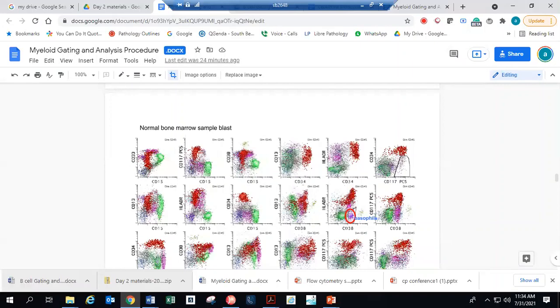Okay. And those populations can actually be gated there, and they use the markers just to clean up, to make sure that the CD45 versus side scatter gate is perfect. But mainly they use only CD45 versus side scatter first. Right, exactly.